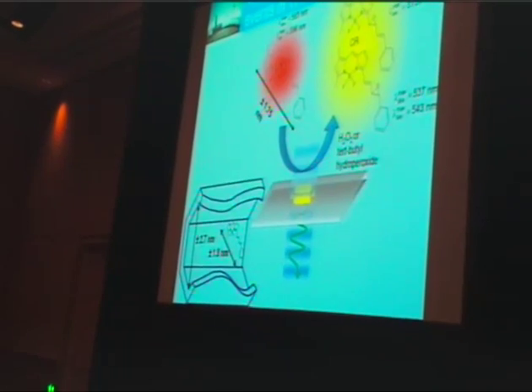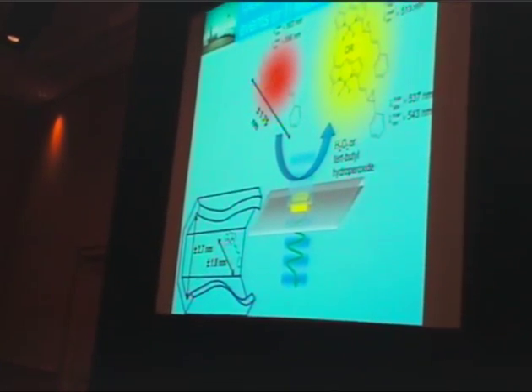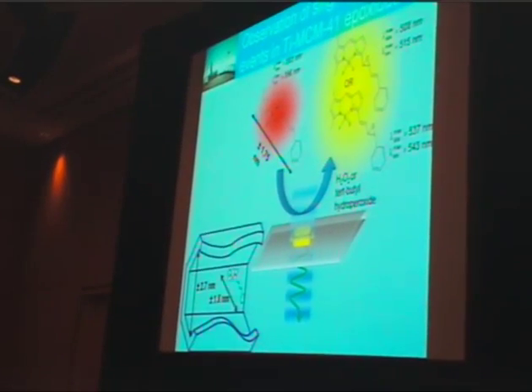So we immobilized the titanium MCM particles on the cover slide, added the reactants and the probe. And here I will show you a movie of the fluorescence intensity that we could record from these experiments. I don't know if it's very clear, but you can see at the bottom part of this image vaguely the contours of three titanium MCM41 particles, here, here, and here. Each of them are a few micrometers in size.